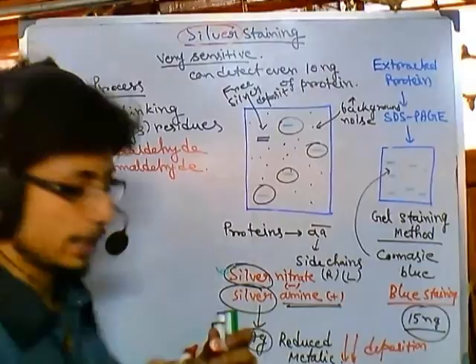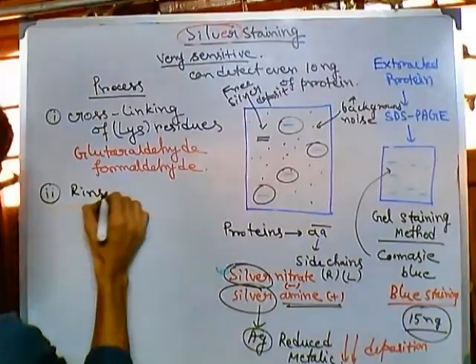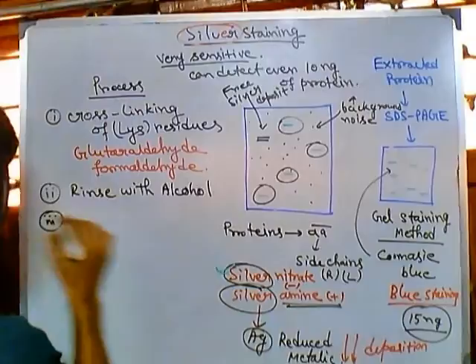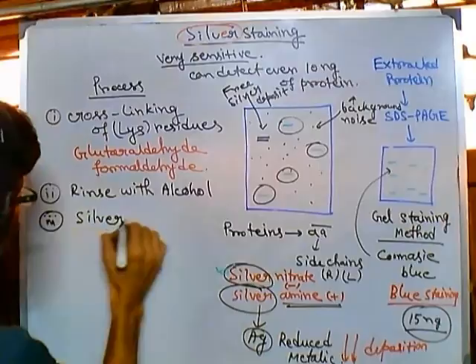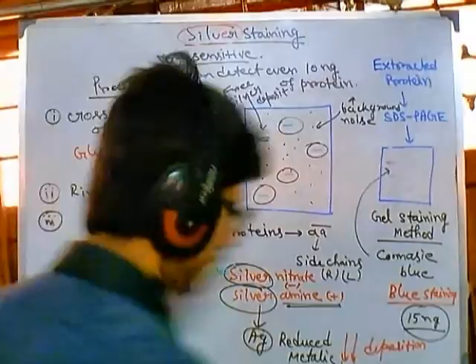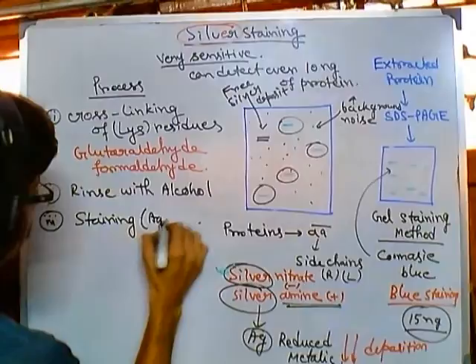After this step, we need to rinse it with alcohol. Not all the steps are equally important, but it is simple rinsing with alcohol. Then the third step is the addition of silver nitrate. So silver nitrate is added there, right? This is called the staining. So let me write it this way: staining with silver nitrate or silver amine, whatever, according to your choice.